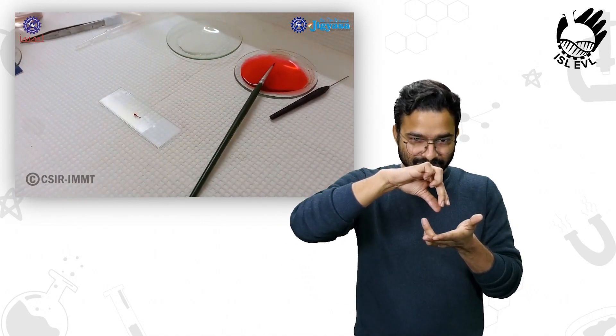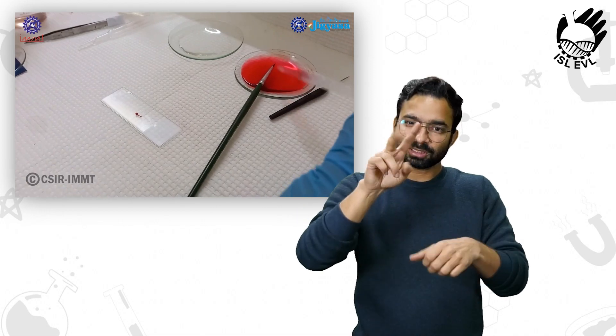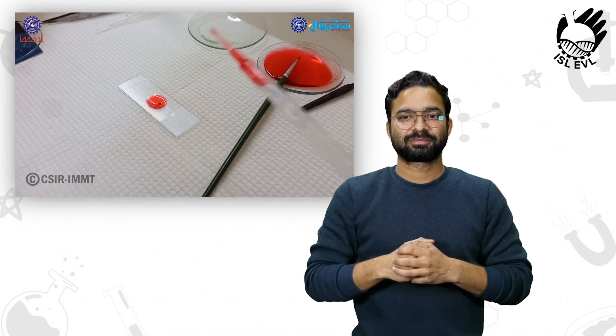We will stain it with safranin. For that, we will take a dropper and add one to two drops of stain on it, and let it sit for a few minutes.